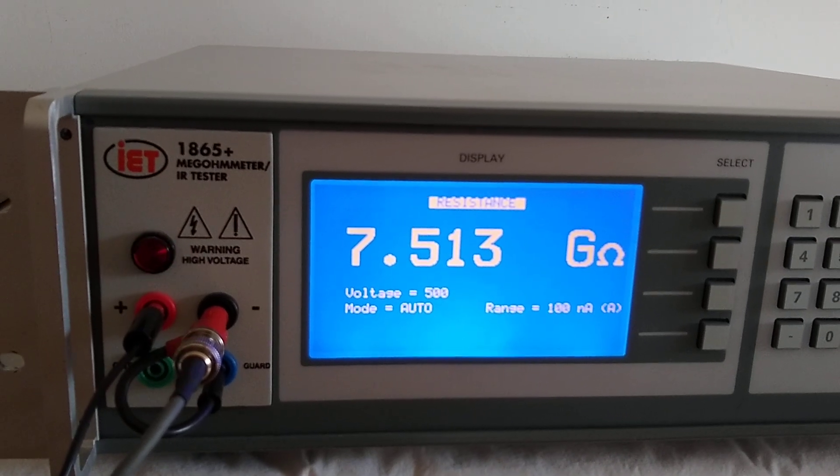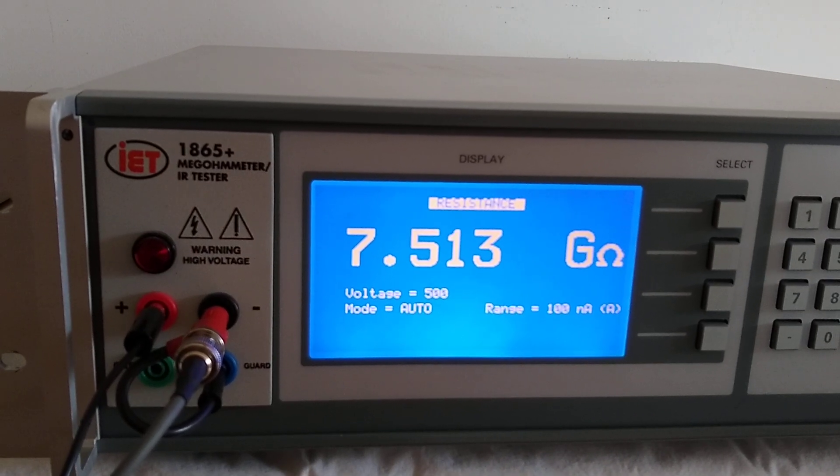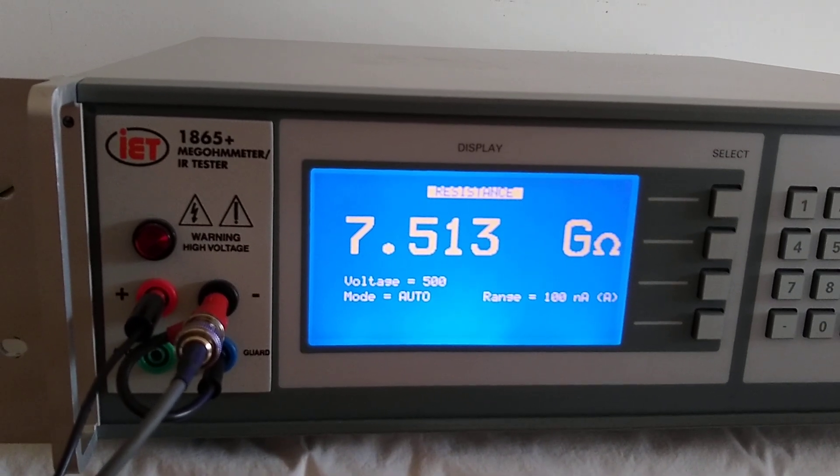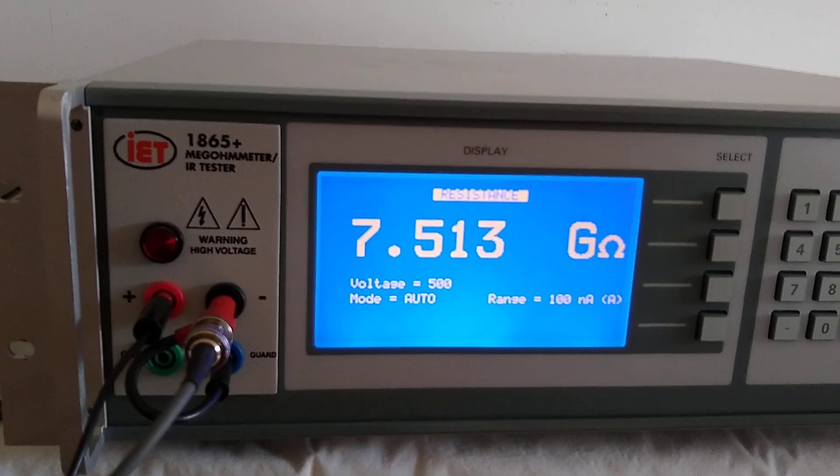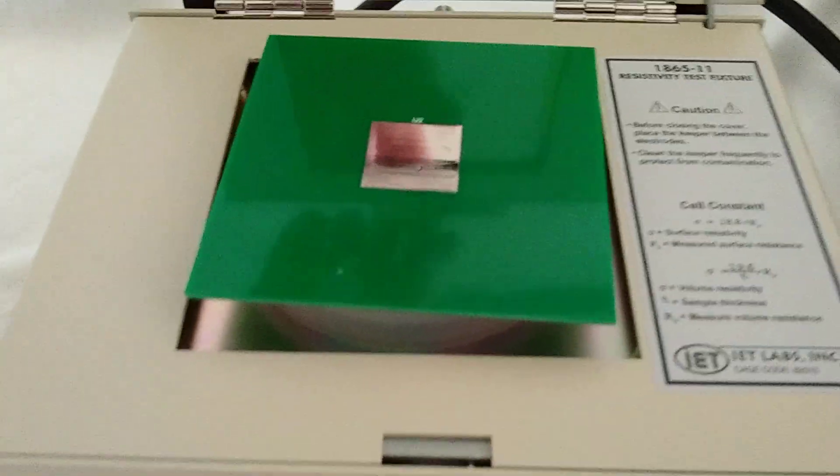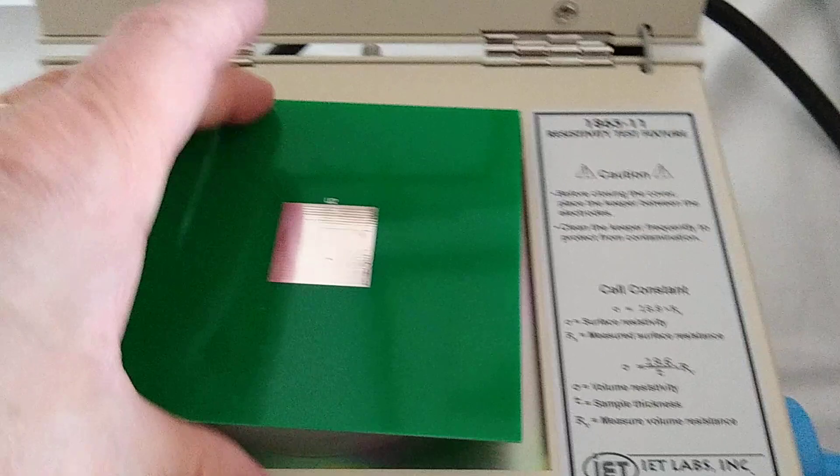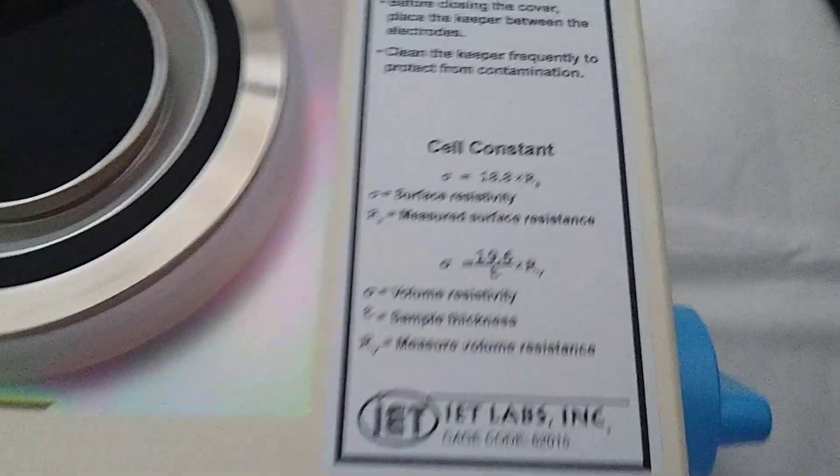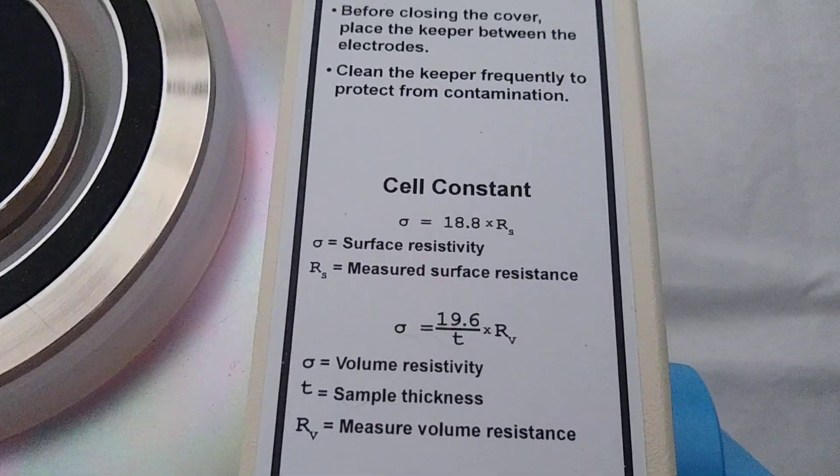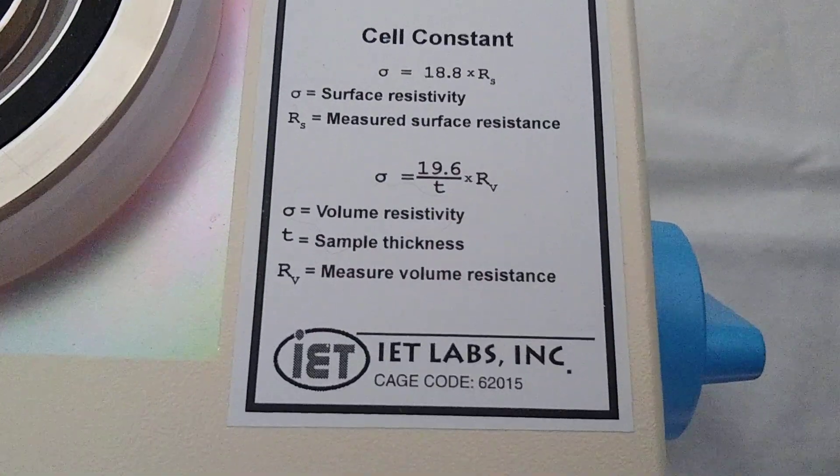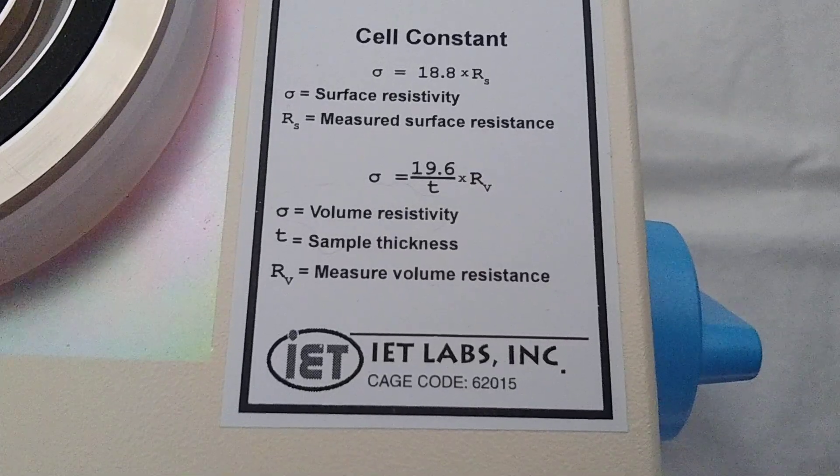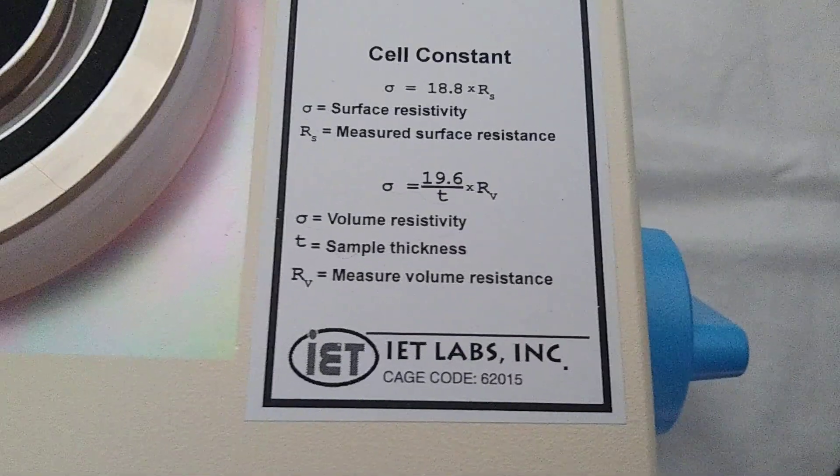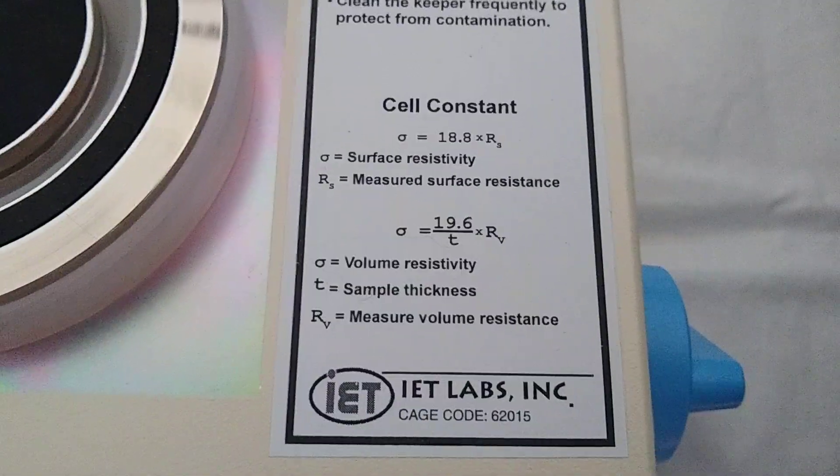In approximately 20 seconds, the unit will stop performing its measurement. At that point, we could basically remove the sample from the cell. We would then take that seven and a half gig, multiply it by 19.6, and divide it by the thickness of the sample.